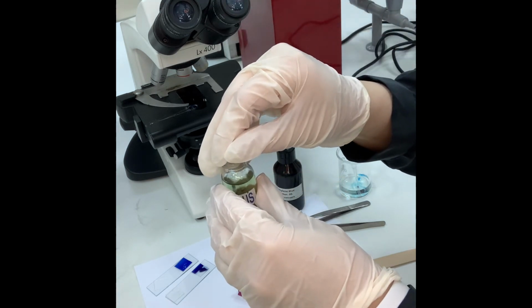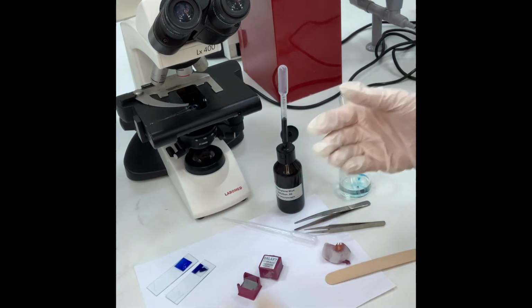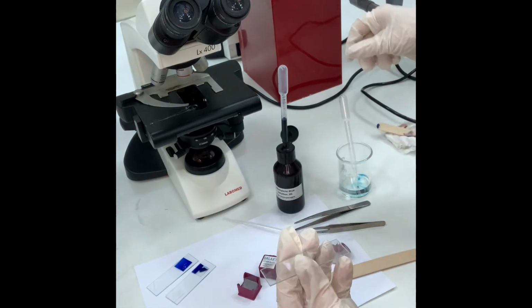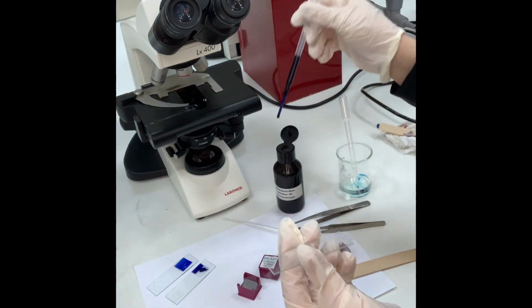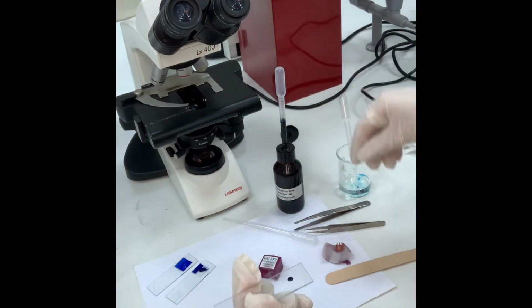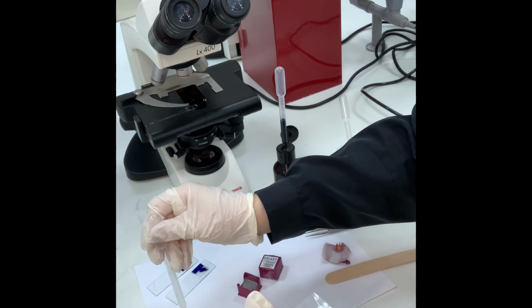But I will do both samples. So again, no need to put a drop of water. I will add a very small drop of stain because it's going to be a bit messy if I add too much liquid.